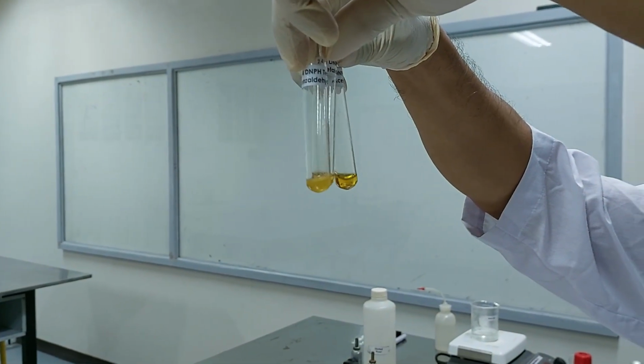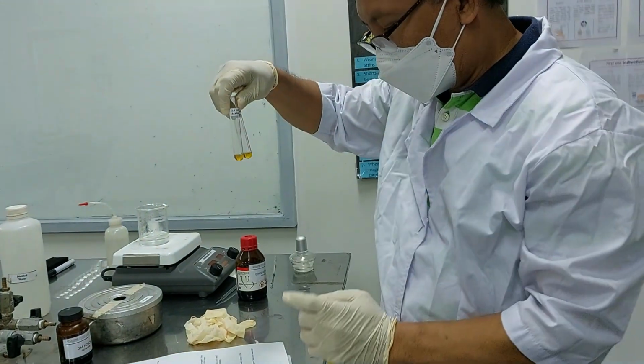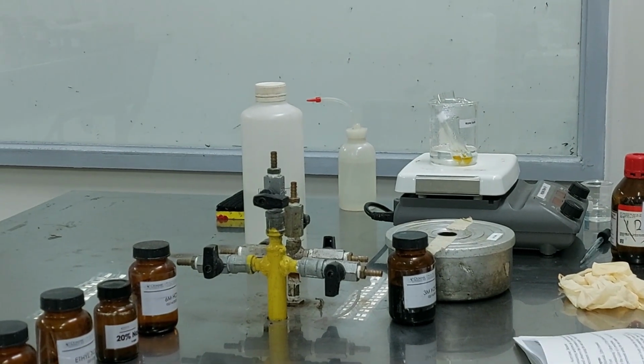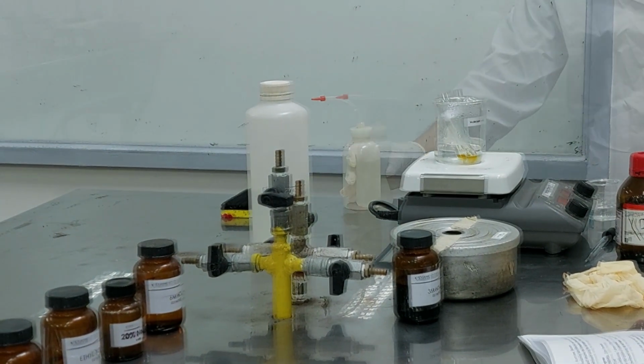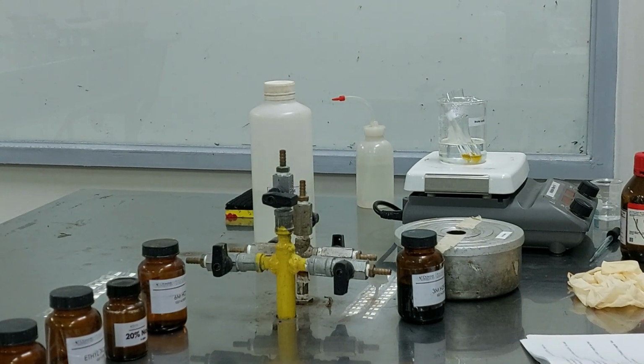So we'll heat this a little bit because it needs a little heating. Okay, so we'll check that after a few minutes. While waiting for the reaction, let's go to the next test.